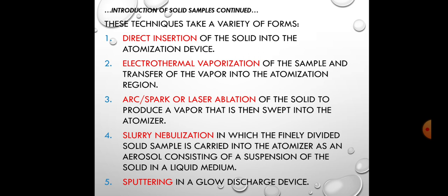But how can it be possible? How can we introduce a solid sample into the atomizer? There are many different methods, five of them are mentioned here. These techniques take a variety of forms.